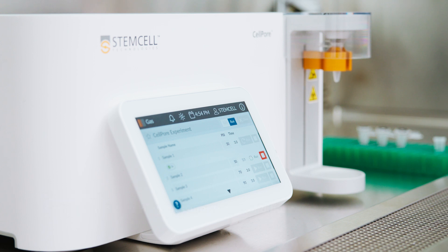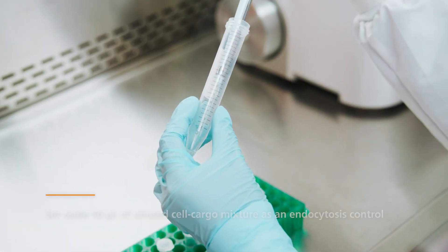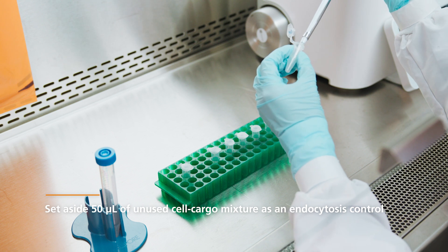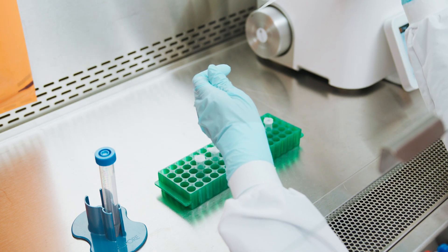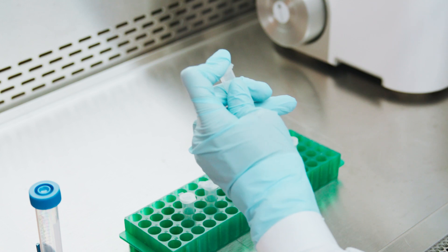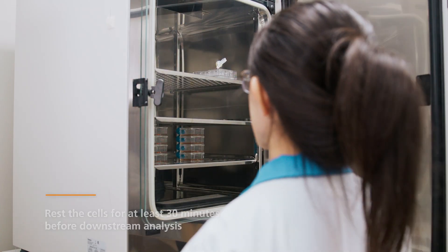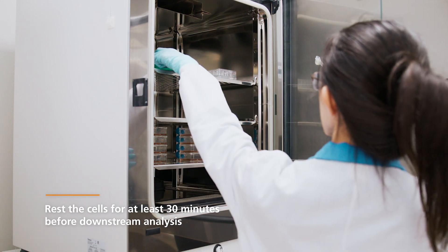Ensure a new cartridge and collection tube are used for each sample. Once complete, the remaining 50 µL cell and cargo mixture is used as an endocytosis delivery control. Transfer 150 µL of CellPore delivery medium to this sample, as well as to the untreated aliquot set aside earlier. Transfer the tubes to the incubator for at least 30 minutes. Some cell types may benefit from a longer rest period, up to two hours at this stage.